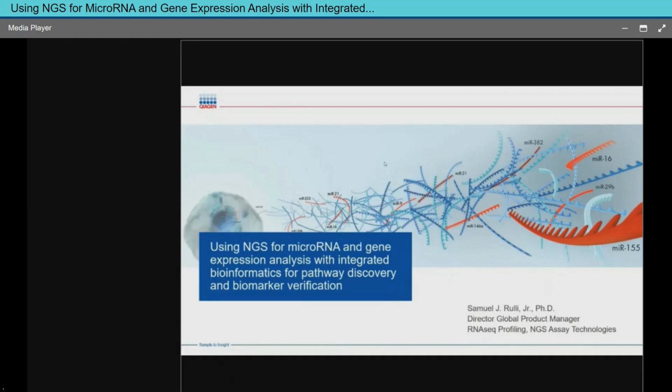For anyone who's working in a lab and has gone through an NGS experiment, you know there are a lot of different steps and you may not be in control of all those steps. Sometimes that can be frustrating, but moreover, it can lead to a long time between when you first get your samples and when you're actually looking at your differentially expressed microRNAs. And as a lot of us working in the lab know, that's not even the end game.